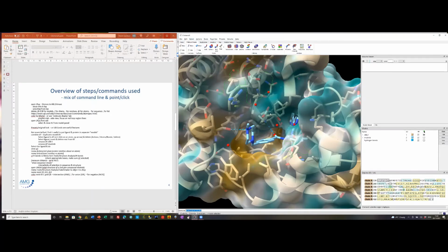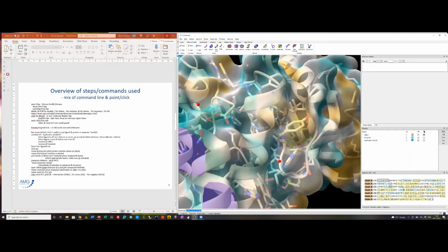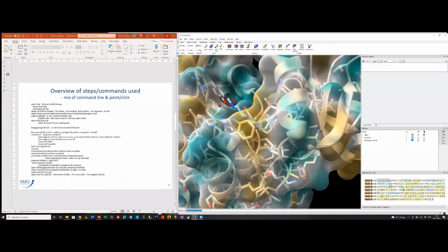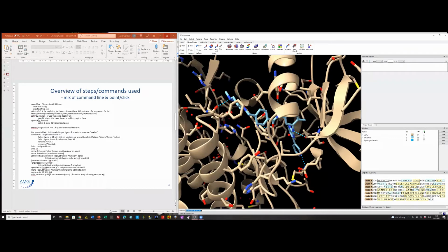And you can see that we get the residues, and in this case it's surface. If I keep the surface on, I think for this purpose I might turn the surface off. That's because I've got something selected. Right. So if you've got something selected, the actions are going to operate on the selected atoms or residues or sequences.